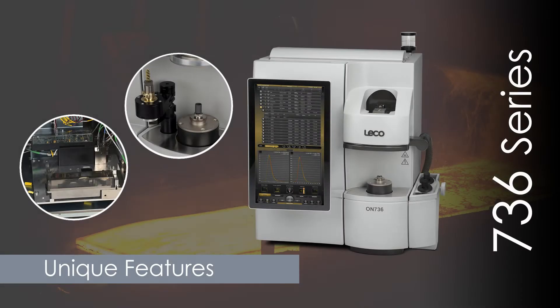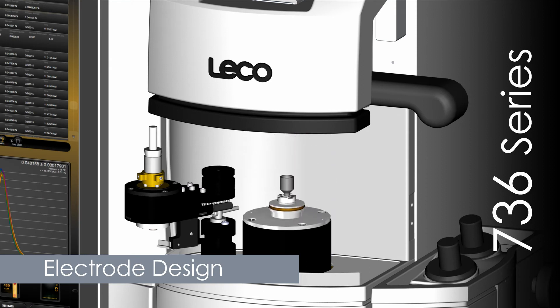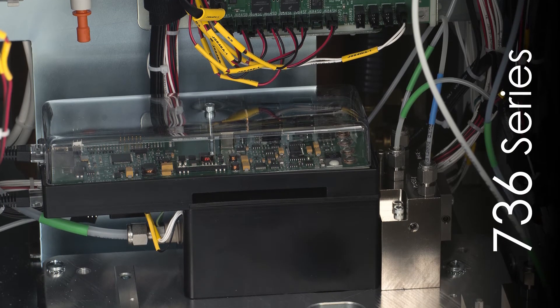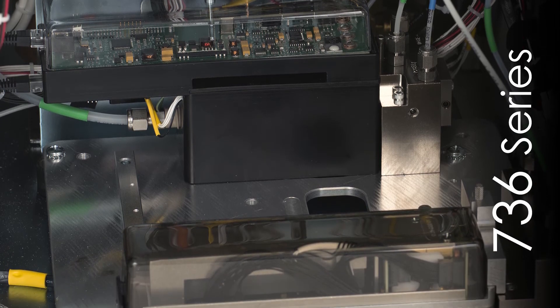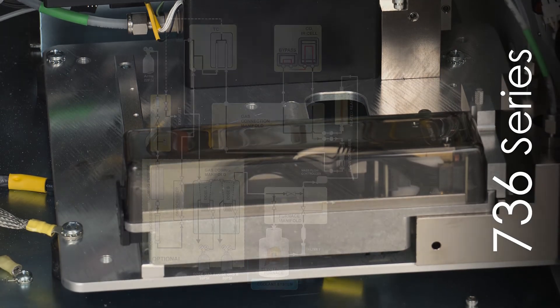Now let's look at some of the instrument's other unique features. A novel electrode design increases heat transfer efficiency for greater stability. The 736 series features an improved detector design with thermostatic construction, increasing protection for ambient temperature fluctuations. Optimized emitter control and detection circuitry improves the IR cell lifetime and long-term stability, resulting in superior accuracy and precision.